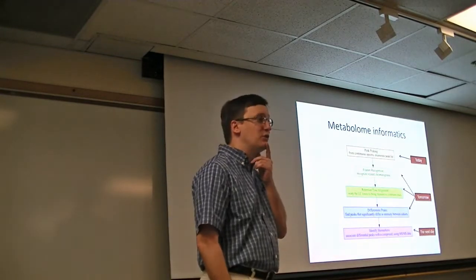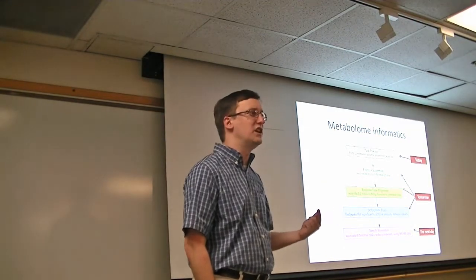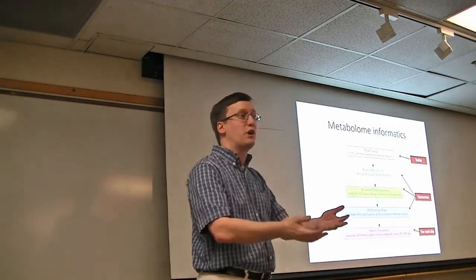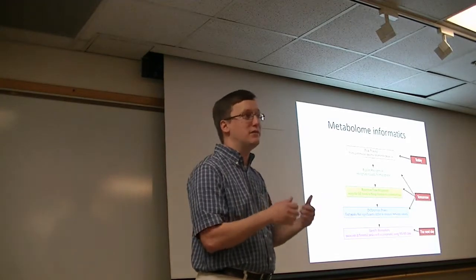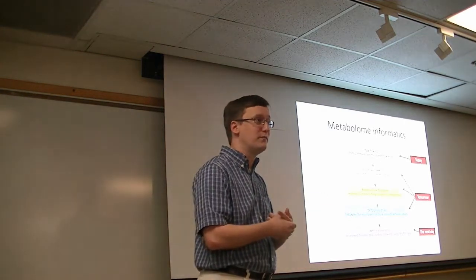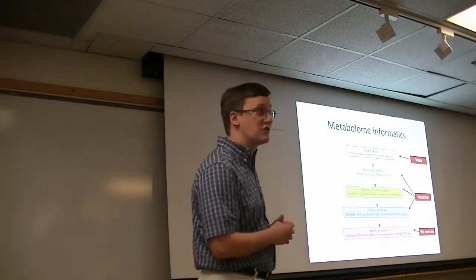But what I'm going to try to do with this workshop is cover the essential pieces that you would need in order to do a discovery experiment in metabolomics, where you start with raw data, figure out which ions differ, and then based on that analysis, follow up the interesting ones to produce identifications for them. And that, in effect, covers the 3 afternoons of this workshop.